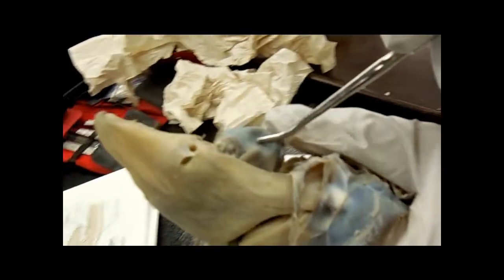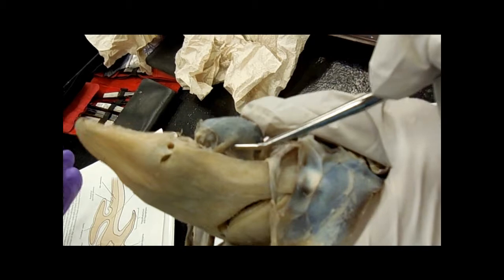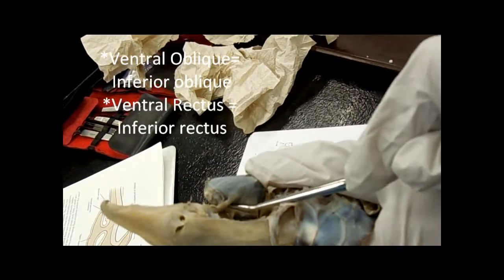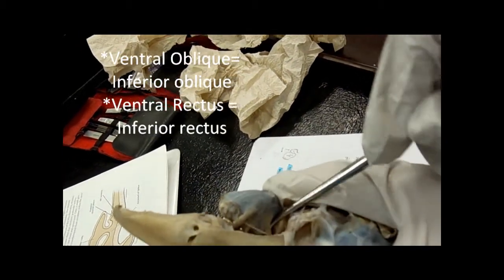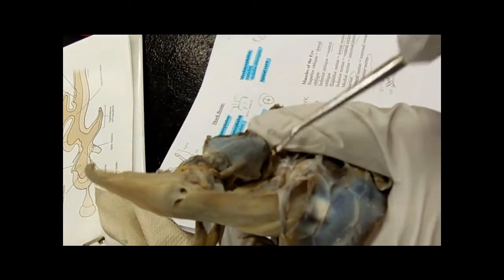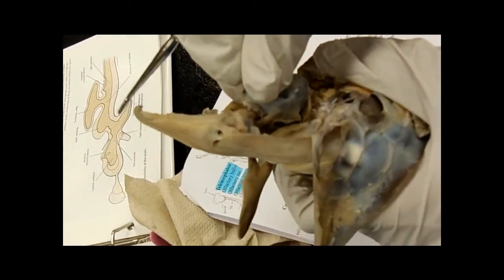You go under the eye, you get the, oh yeah, I tore it off here. You get this one, this is the ventral oblique, ventral rectus.